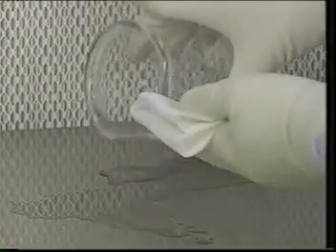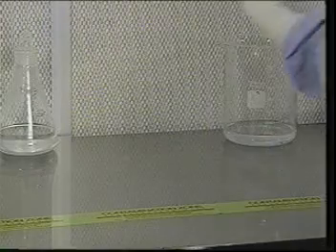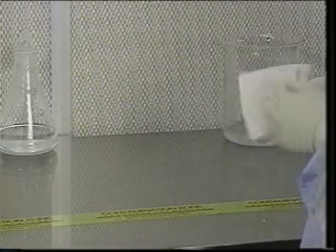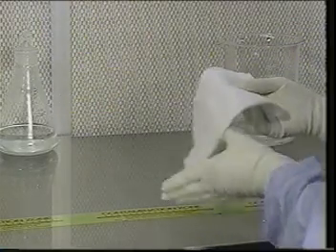You'll first want to blot up most of the spill with dry wipers. To clean up the remainder of the spill, wipe slowly, about 1 foot per second, from the cleanest to the least clean region of the surface you're wiping. When you're finished with them, all wipers should be disposed of in accordance with the procedures established at your site. Once again, the key to effective cleaning is to avoid bringing contamination back onto an already clean surface.